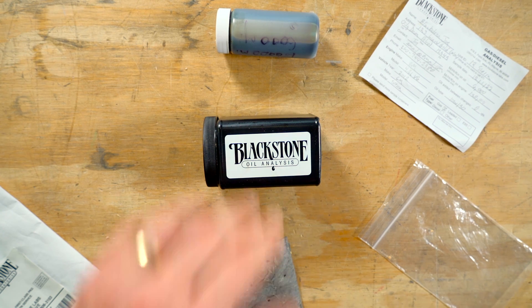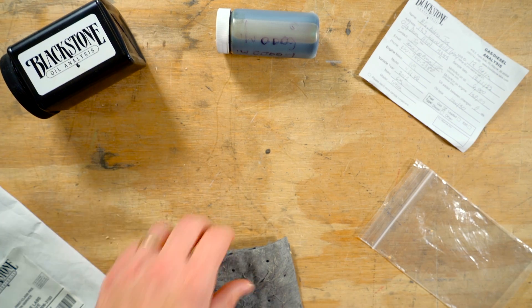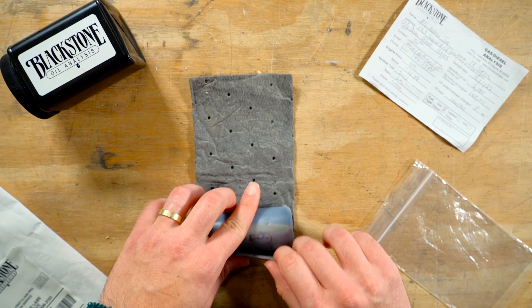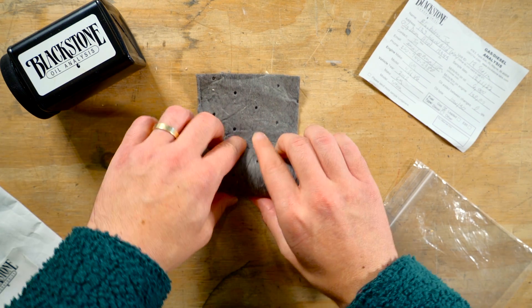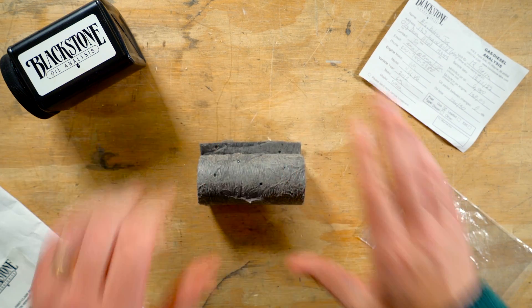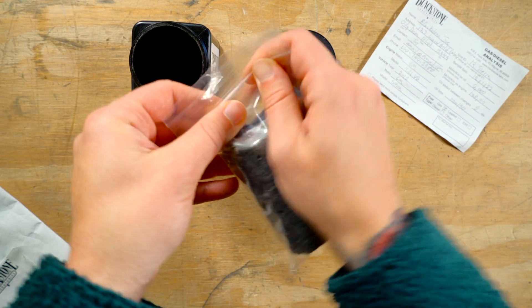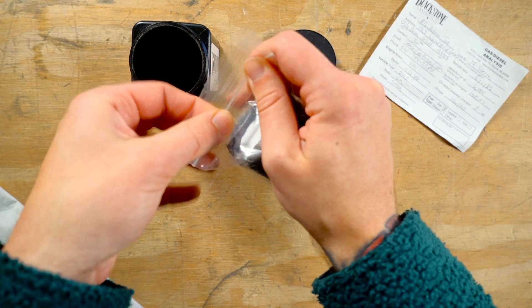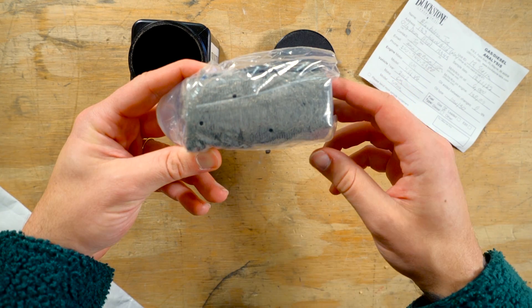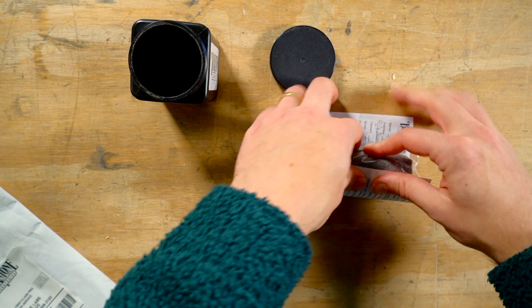Now let's begin. Take the oil sample bottle and roll it up in the gray absorbent material, and then secure it in the plastic bag. Now be sure to include the oil information slip filled out on the front and back. There are two ways that you can include this slip.